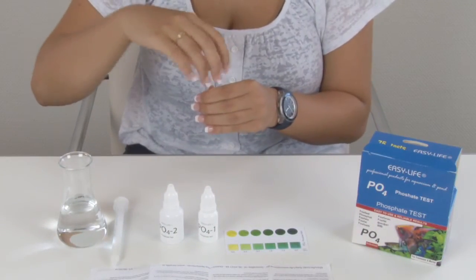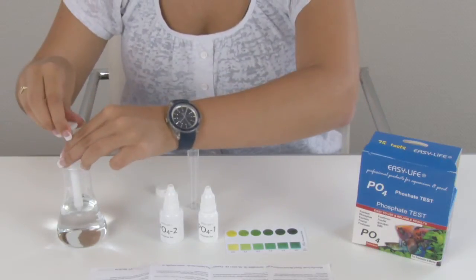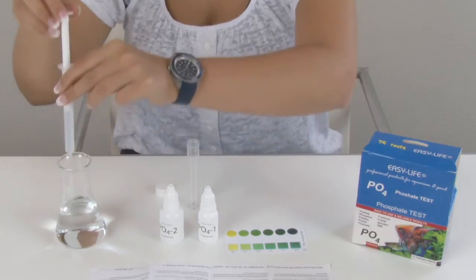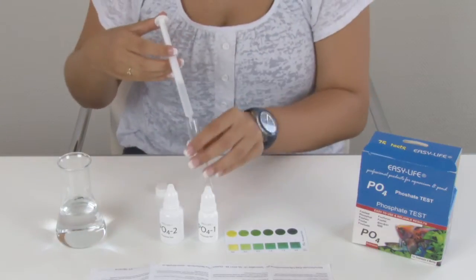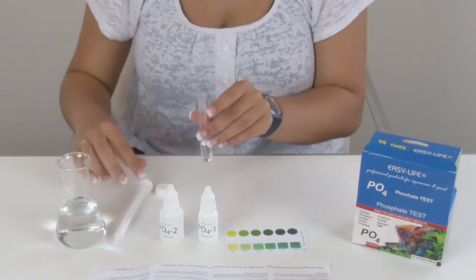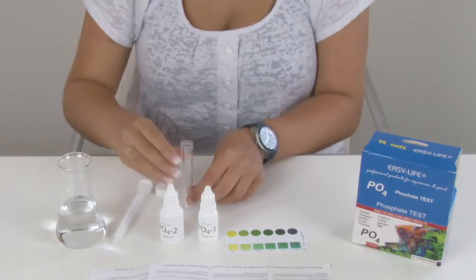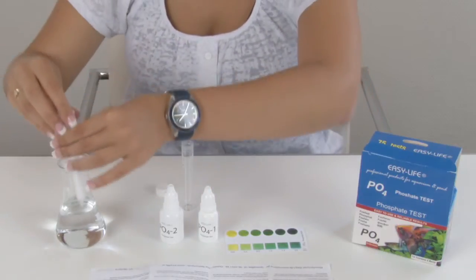Rinse the test tube with some sample water and fill it with 2ml of sample water.